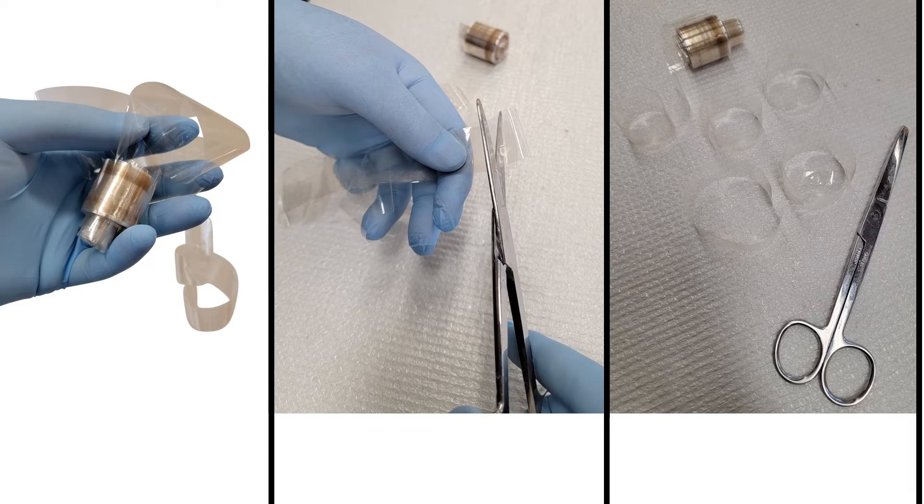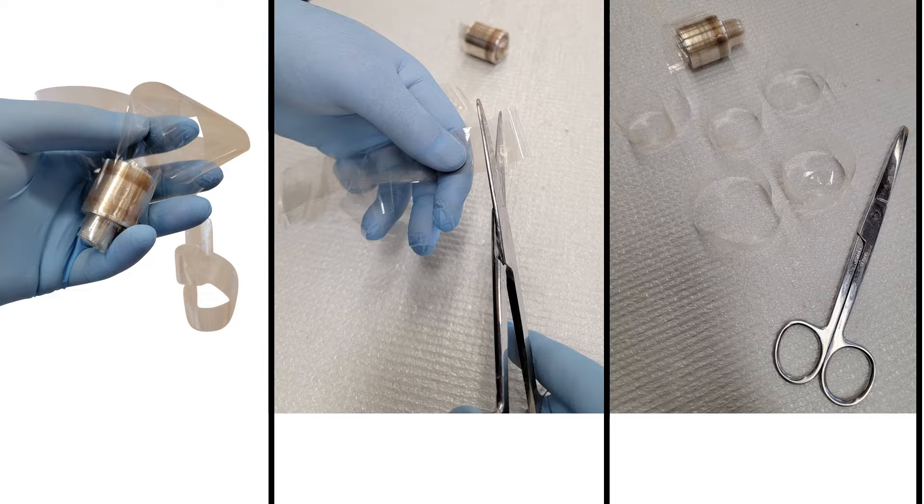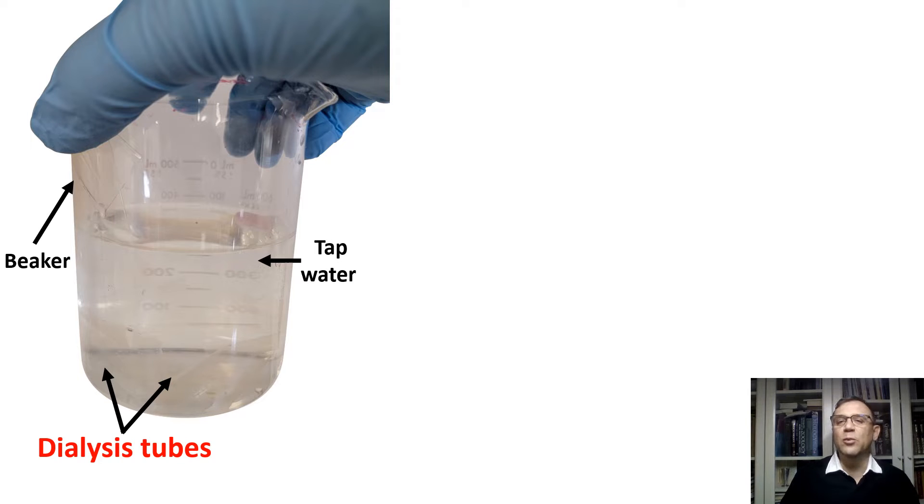We have five dialysis tubes from which we will make dialysis bags. Now we need to submerge all of our bags in tap water at the same time. As you can see on the screen, I have placed them in a beaker. We will need to leave them there for about a minute to soak. This will allow us to open them up and turn them into dialysis bags.